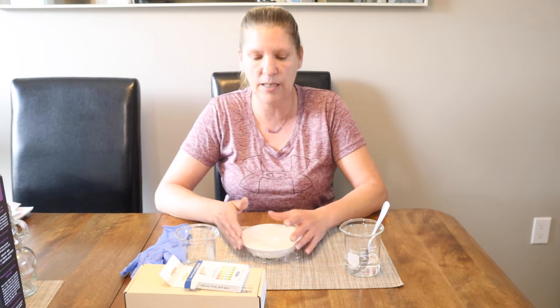So let's start going over how you will raise and lower pH. The very first thing you want to do after making a product is test its pH. It's really hard to determine where pH will land just by looking at your ingredients. Even if you use an ingredient with a really high pH range, you can guess you'll need to adjust, but guessing doesn't work with pH — you have to test it. Once you blend all those ingredients together, it's really hard to tell where that pH range is going to land, or if it's going to drift.